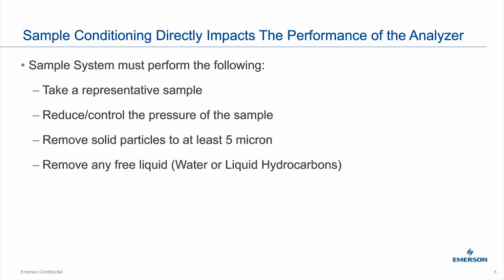Also remove any free liquids. Again, the GC operates on clean, dry gas. Anything that's not that will be a problem for the GC and could be a very expensive repair.